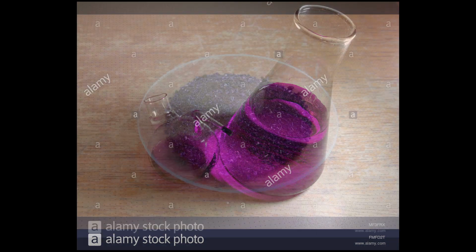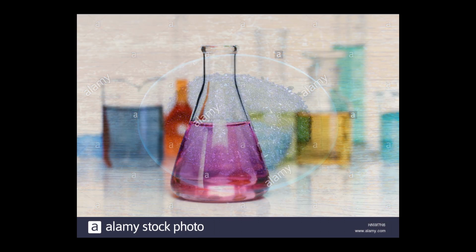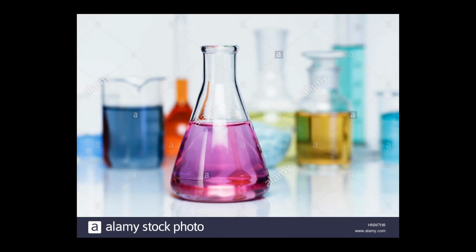In the meantime, we can start to prepare the potassium permanganate standard solution. For this, you can start off by measuring out any amount of potassium permanganate into a 250 ml volumetric flask. I ended up using 0.3 grams as a strong concentration of potassium permanganate will be needed to titrate the iron solution. After the potassium permanganate is measured out, you can fill the volumetric flask up to the mark with distilled water. Once this is done, we can start to set up the burette.